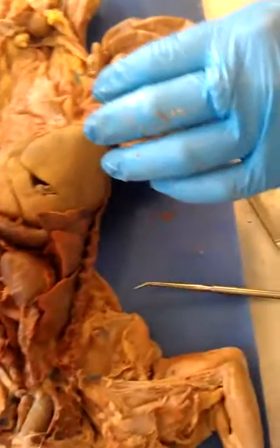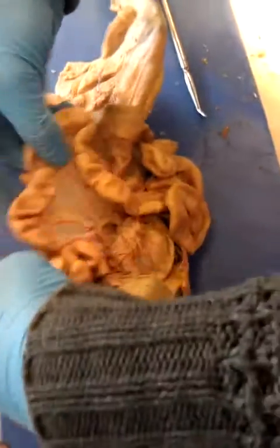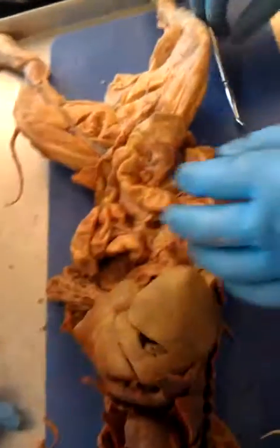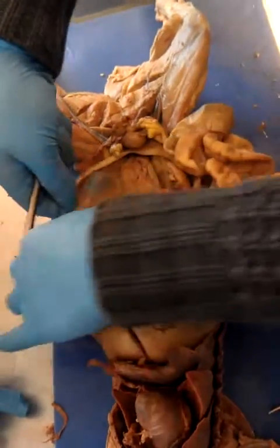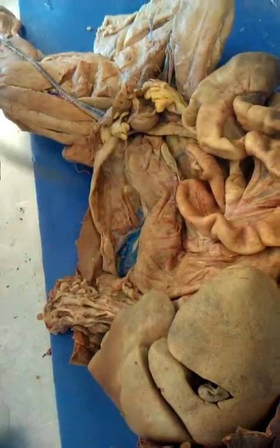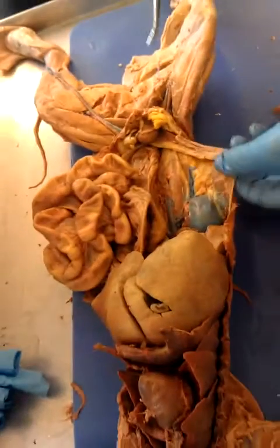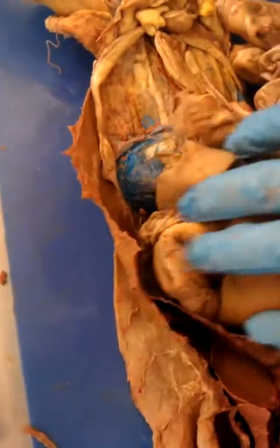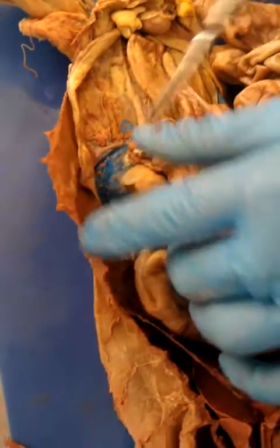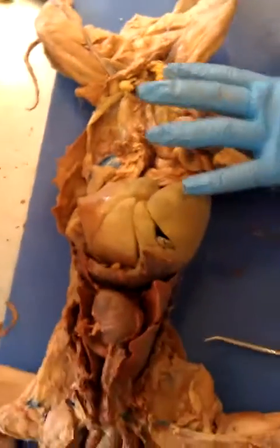And what do we got now? Mesenteries is just all of this thin material in between the intestines. Ovaries I showed earlier, so I'll show them on the other side. This right here is an ovary, and this is, like I said, the uterine horn. Same thing on the other side. So there's the ovary on this side and the uterine horn. The pancreas and the spleen. So this right here is the spleen, and the pancreas is just below it. So you have your spleen, pancreas, kidney, or SPAK.